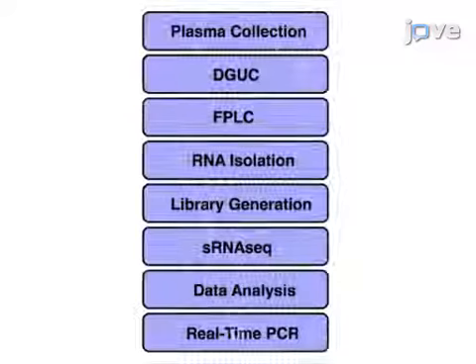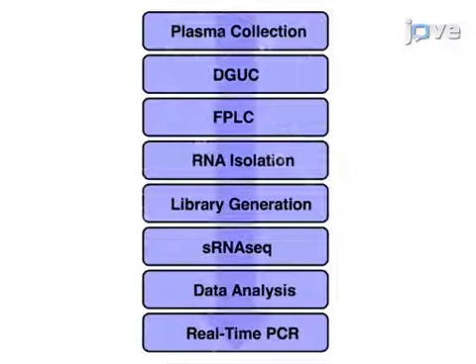This protocol is composed of established methods linked together for the quantification of small RNAs on highly pure HDL using high-throughput sequencing or real-time PCR. This video deals with the purification of the HDL. This protocol is going to be demonstrated by my assistant, Evan Shidari.